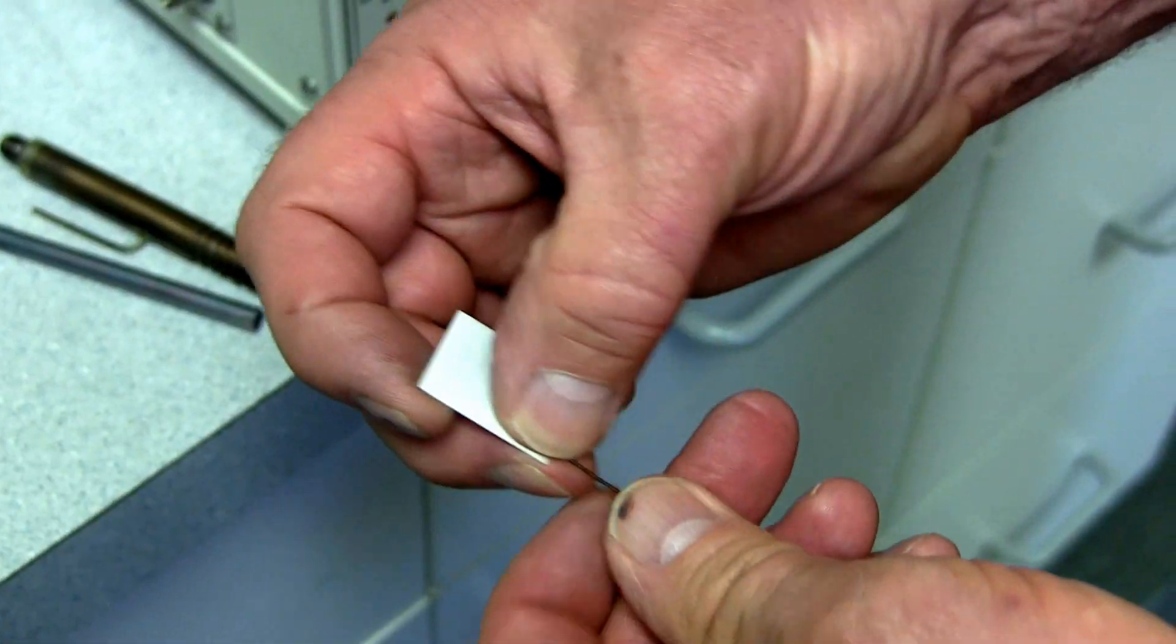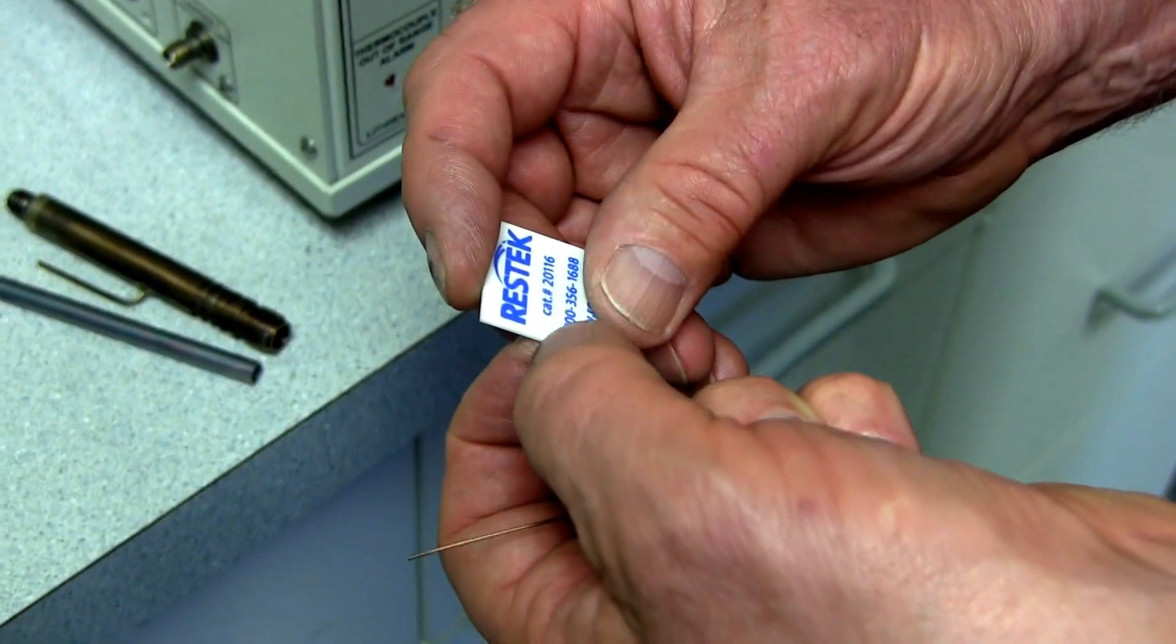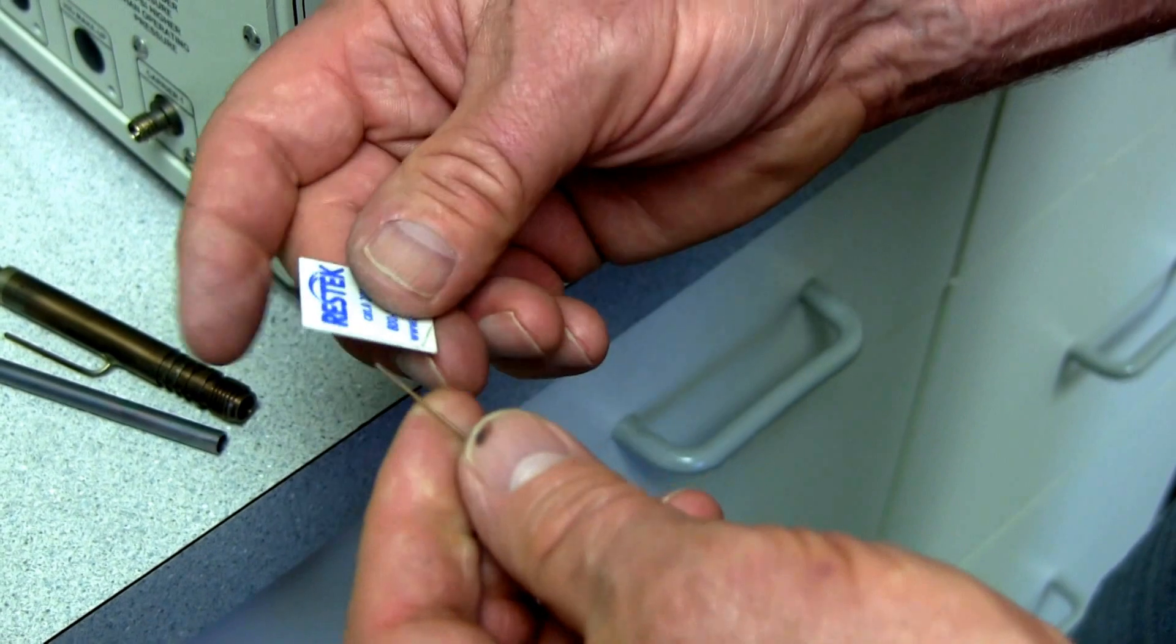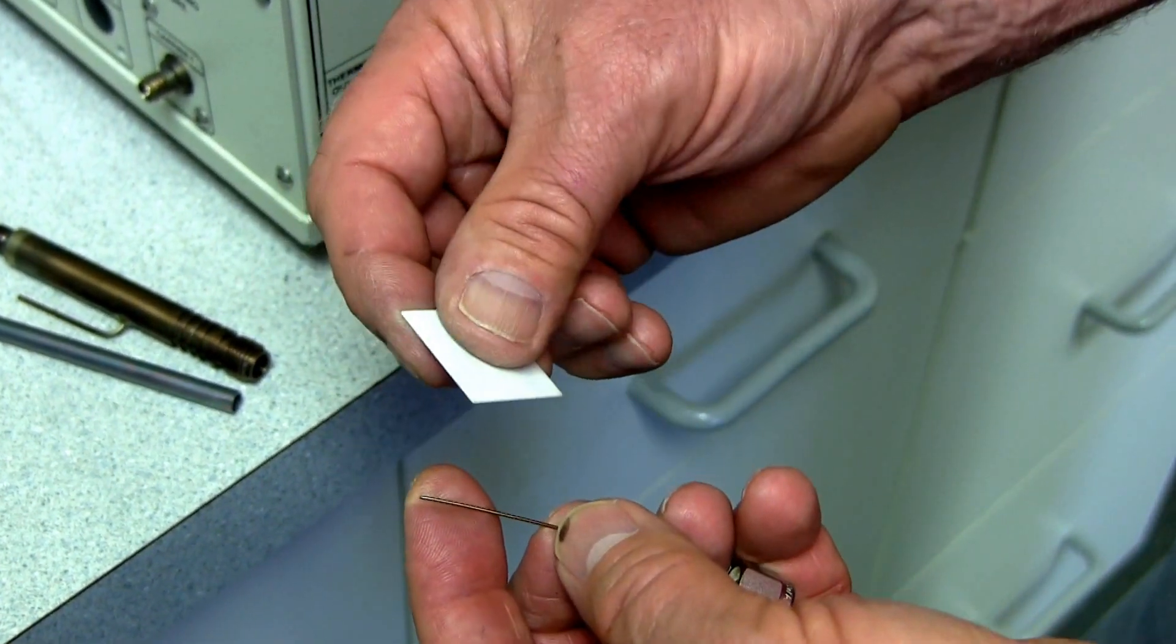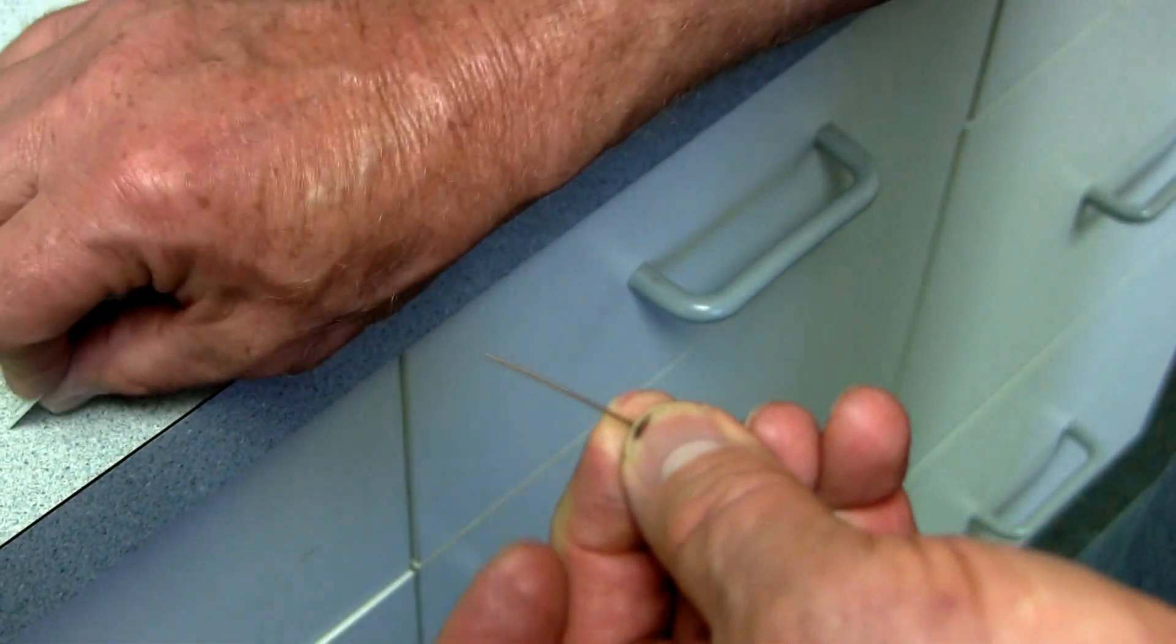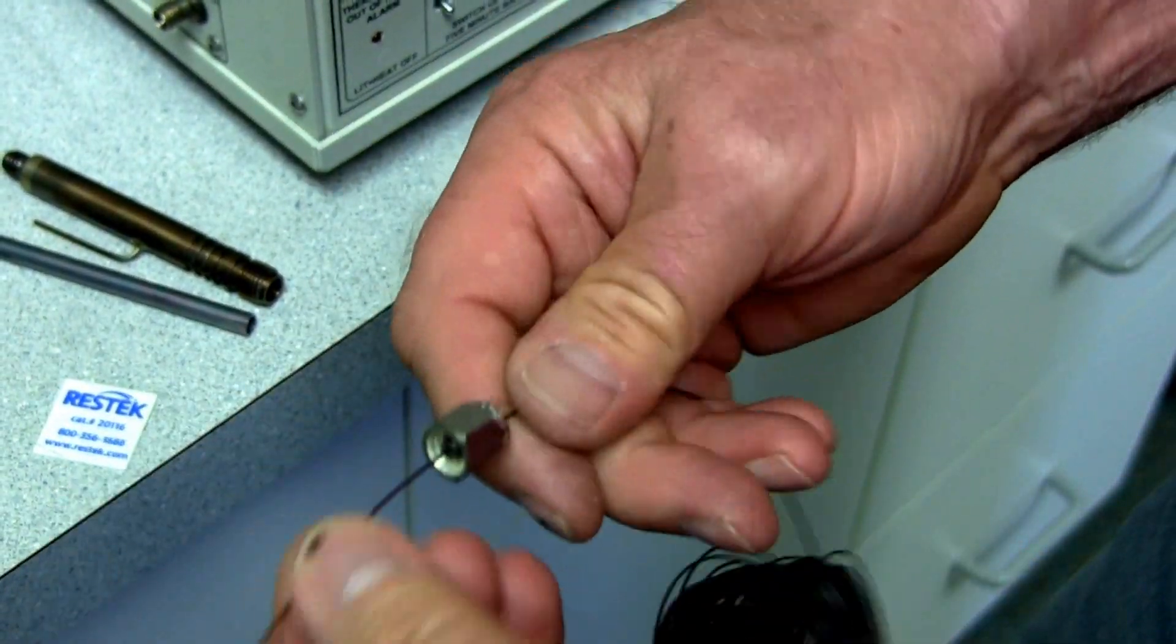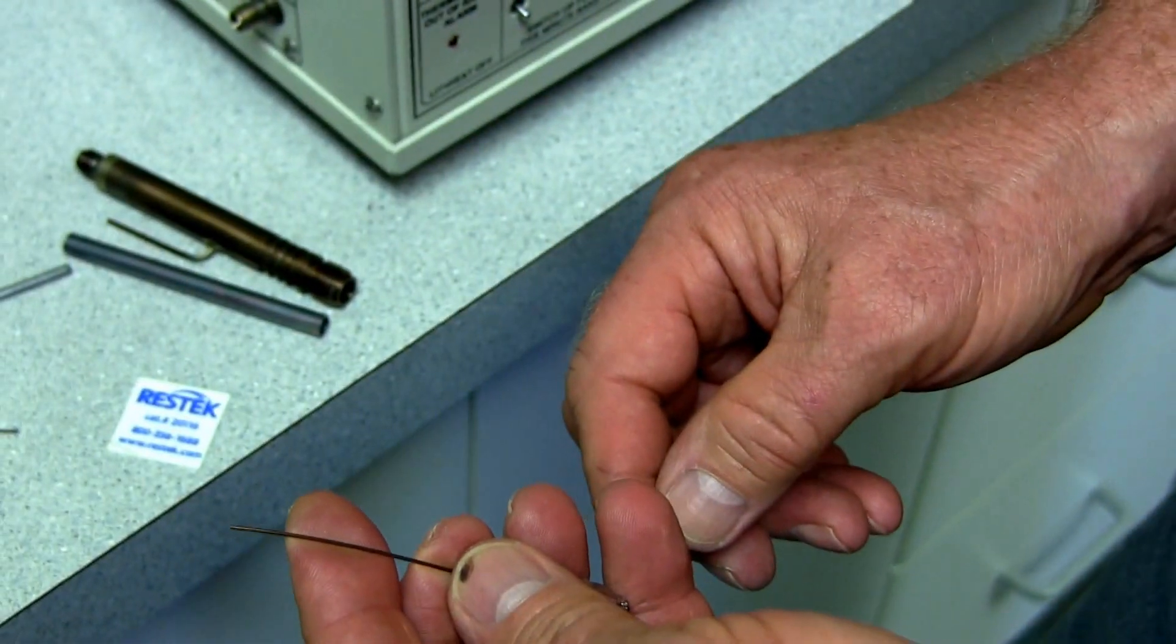Lately the column manufacturers are sending out this what they call a cutting wafer and it's got actually a little abrasive surface on one edge. You have to look at it under a microscope to see that. But you do it the same way. You hold the column between your fingers. You give it a quick little slash with the abrasive disc and then you break it right over your fingernail. Otherwise they won't break. You can't really break these columns unless you give it a deep score first.